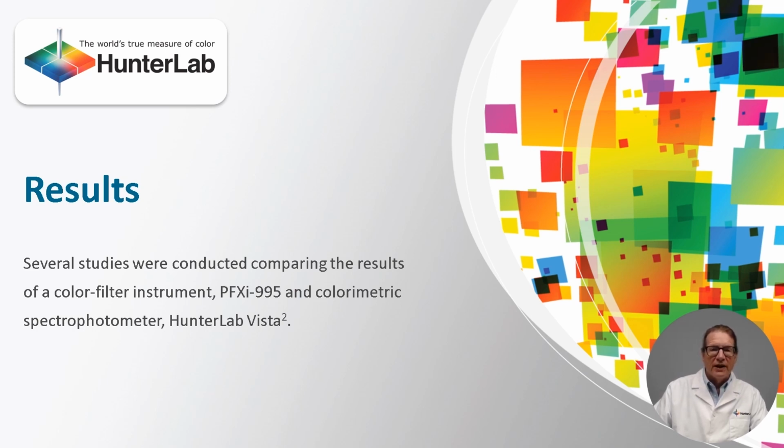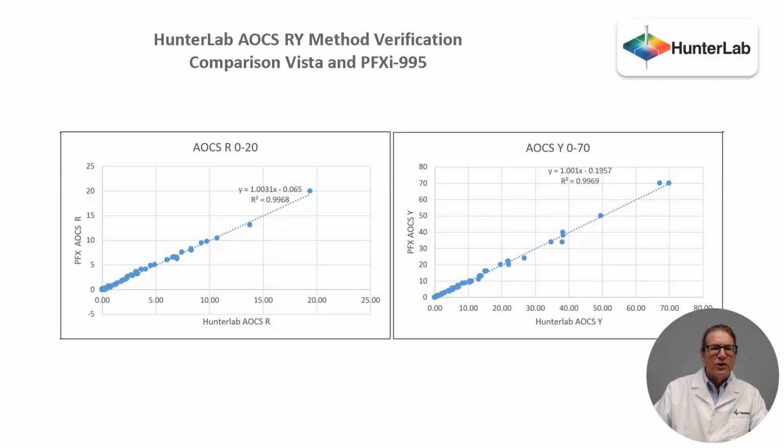and report that result. This needs to be done since a filter colorimeter is limited to only being able to match the color of a solution using their 3 or 4 primary colors at a set path length. If a spectrophotometer were used to measure the colors, then, if the user determined that the 5 1/4 inch equivalent result was too saturated, they could automatically recalculate the value as if it was measured in a 1 inch cell.